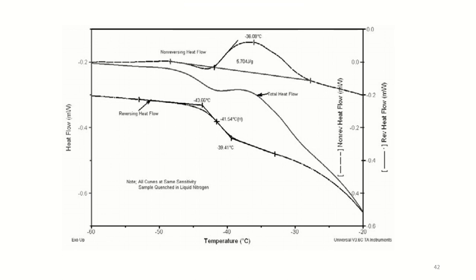The total signal is quite difficult to interpret because it is equivalent to standard differential scanning calorimetry at the same heating rate and contains two different transitions.